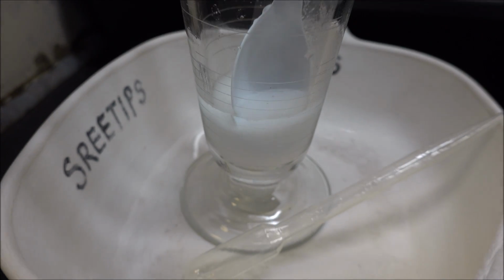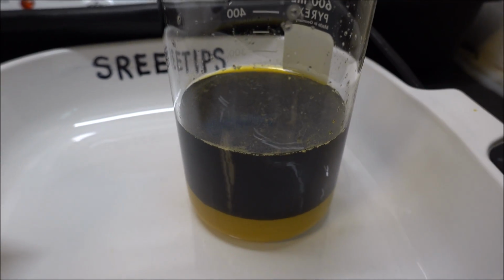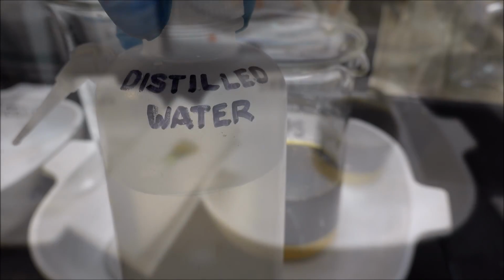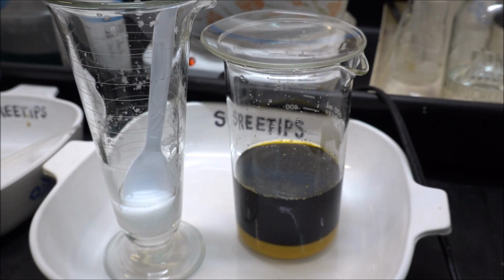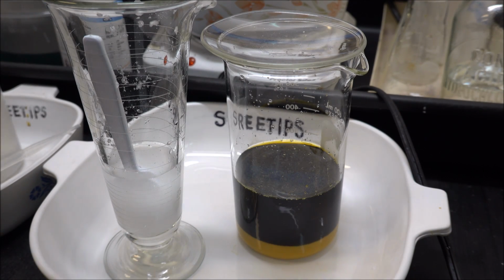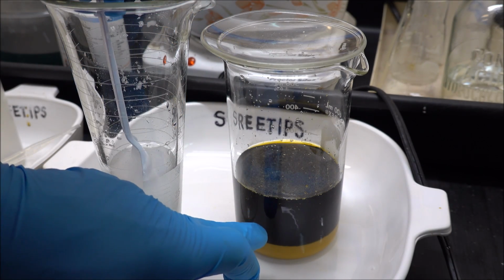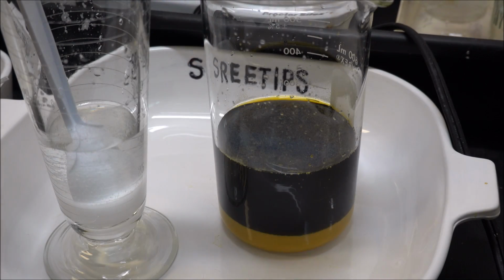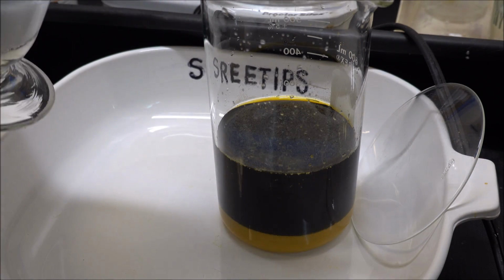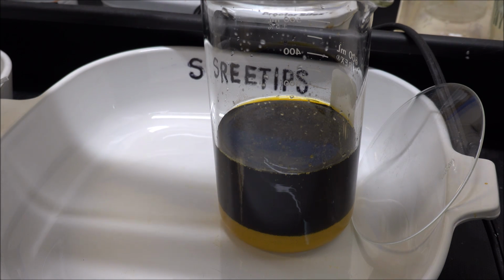So I'm going to add some water to this undissolved ammonium chloride and add that to our beaker, see if we can get some more platinum to precipitate. Based on that last stannous test, I'm going to dissolve a little bit of this ammonium chloride here with some distilled water, and we're going to add that to the solution and see if we can get some more platinum to come out of solution there. If it does, that dark colored liquid on top there will turn cloudy with a little bit of yellow in it.